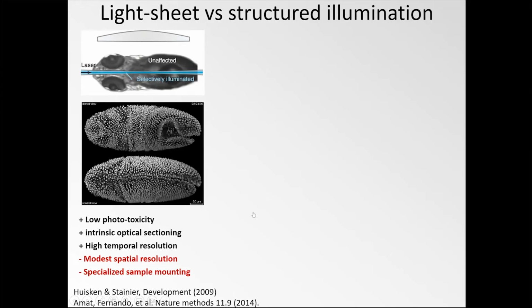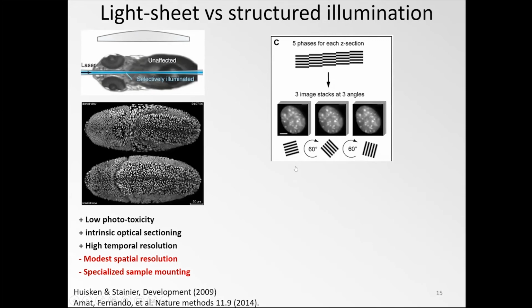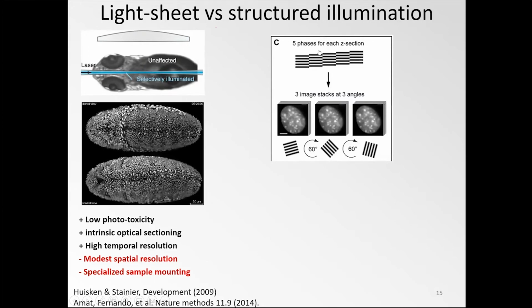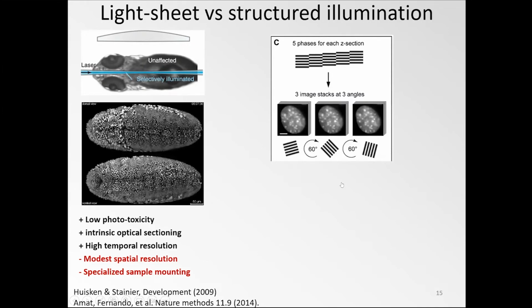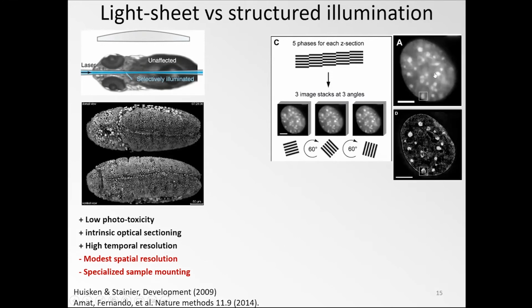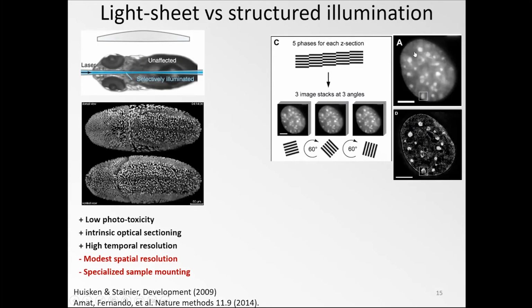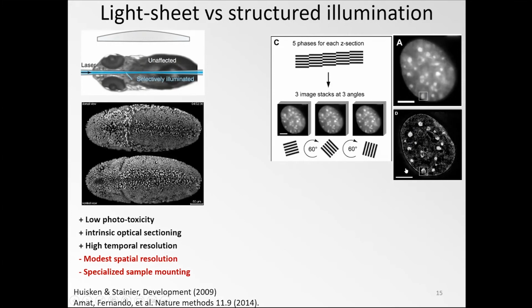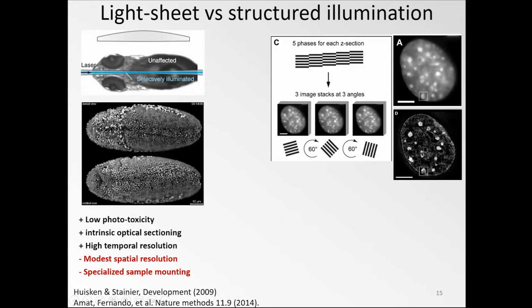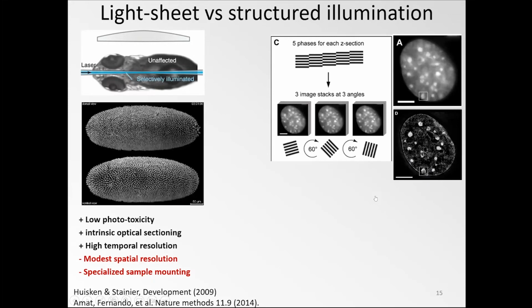different objectives. And then the structured illumination, as we said, you illuminate the sample with a sinusoidal interference pattern. You acquire images of different phases and different orientations. And when you then numerically reconstruct the SIM image, you can usually double the resolution. This was work by Lothar Schermelleh on chromatin organization in the nucleus, and you can see the much higher resolution, or also the definition here of the envelope, and they also looked at some of these chromatin structures inside.